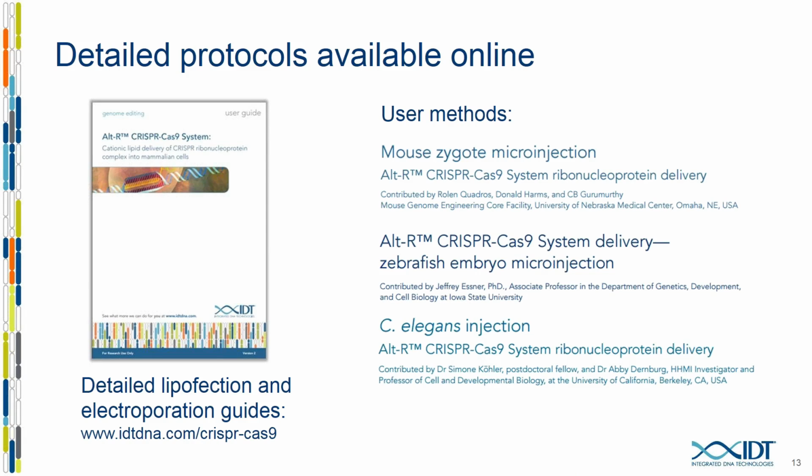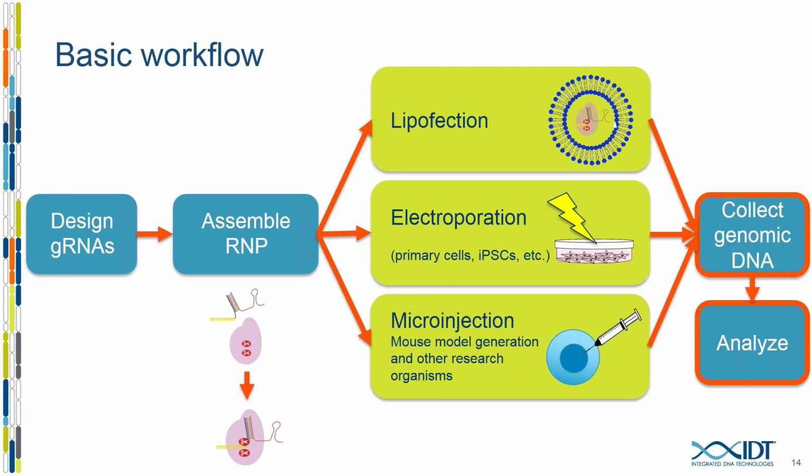So we have a new protocol coming soon for actual mouse electroporation, mouse zygote electroporation. And if you use these tools and find a very efficient method that you'd like to share with the community, please feel free to send that our way. We'd love to share it, and I think that helps everybody accomplish better research.